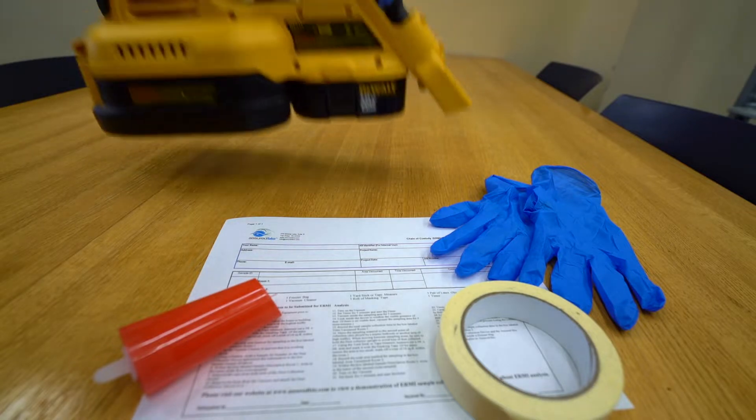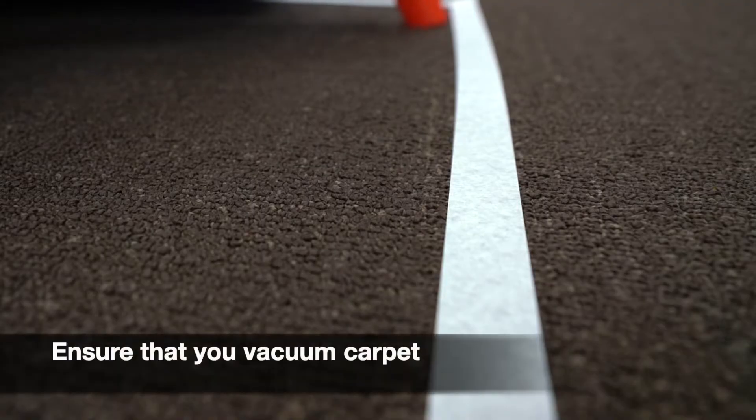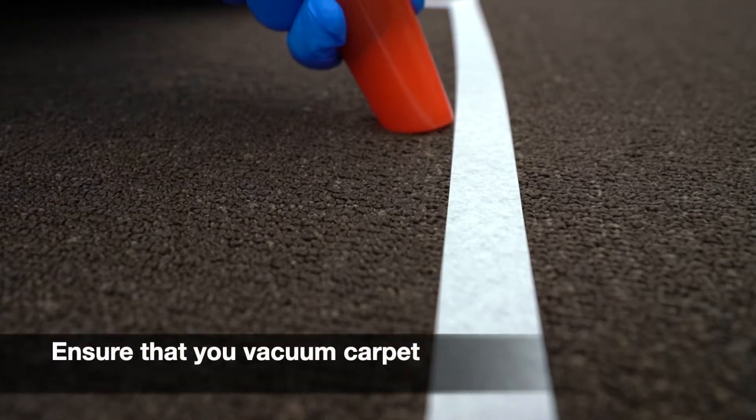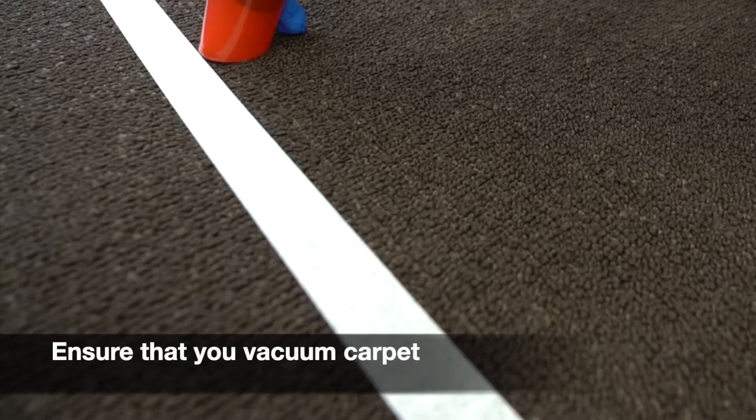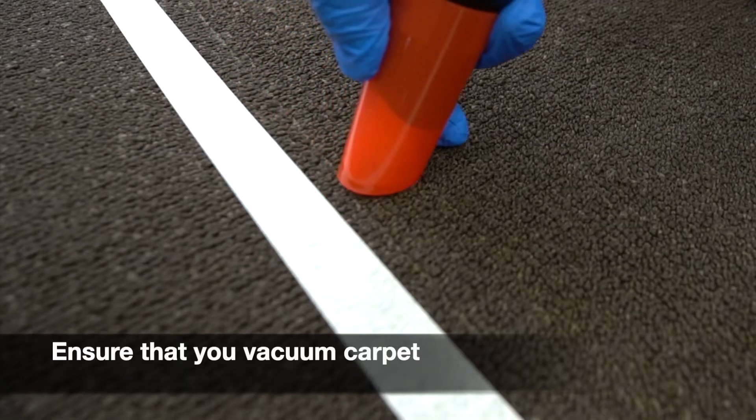Before choosing to collect an ERMI sample, ensure that you have masking tape, a vacuum with a hose attachment, and carpet. In order for your analysis to be classified as an ERMI, ensure that you collect your sample on carpet. Any dust sample not collected on carpet would be considered a SIMS sample, which is a survey of indoor molds.